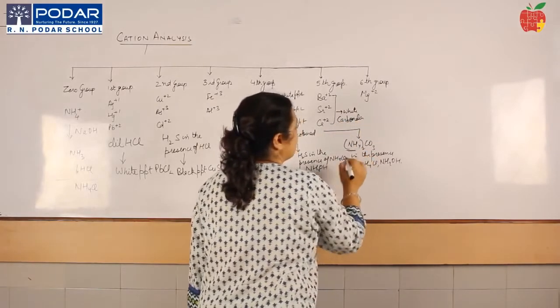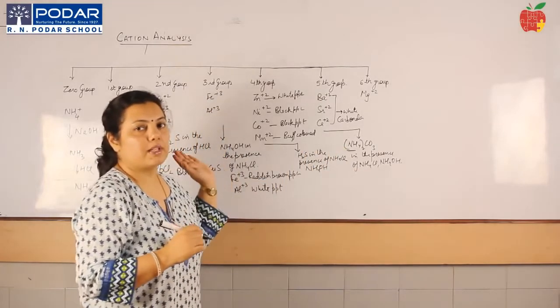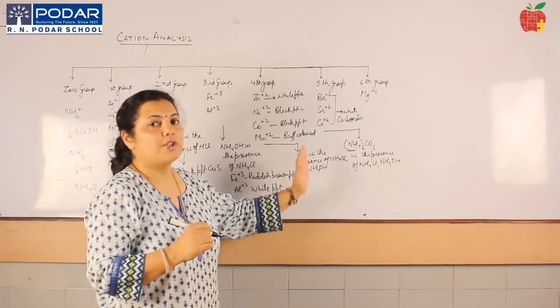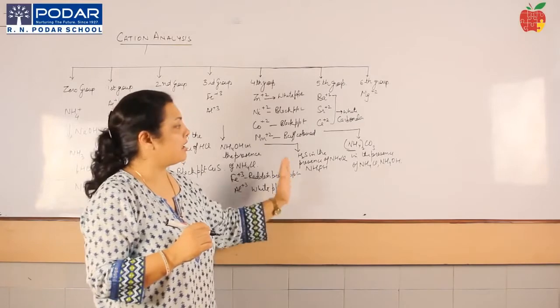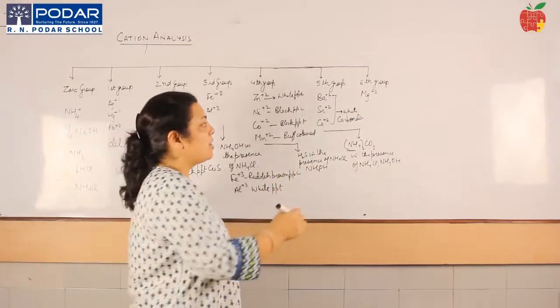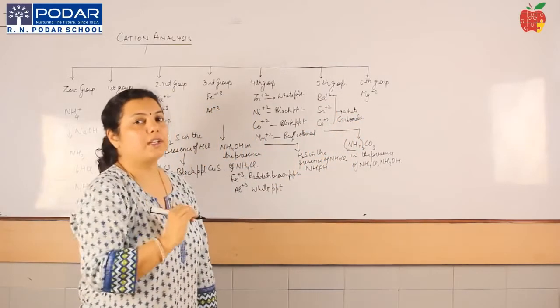So the reagent which is written over here in the presence, now you know that this scheme is based on your solubility product and common ion effect. So you need to understand the common ion effect and the Le Chatelier's principle and the kind of precipitates which are being formed. Okay, so over here carbonates are there, now you get a white precipitate, carry out the confirmatory.